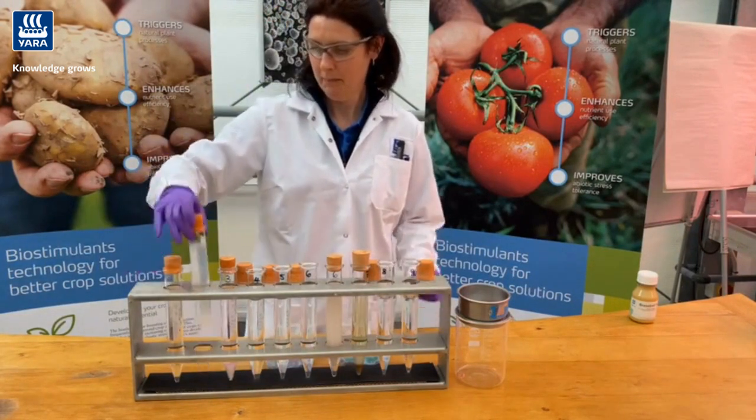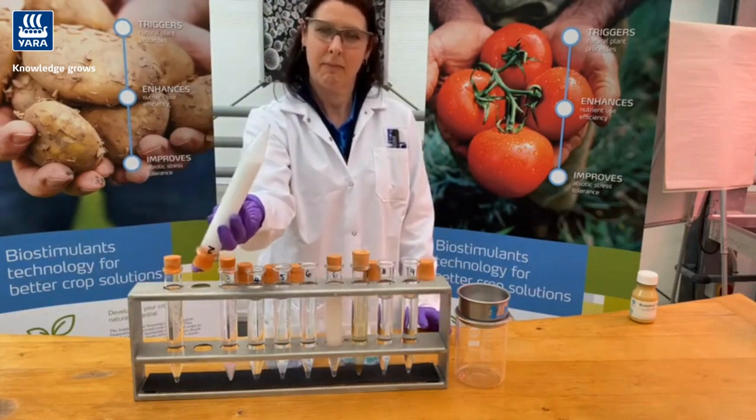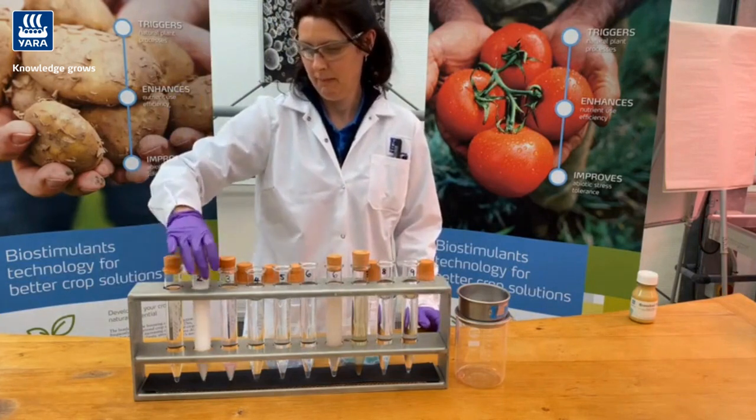This next one is what we would class compatible with agitation. As you can see there, there is some settlement, but the minute we agitate that, it goes back into solution and there is no problem. That we would class as CA.